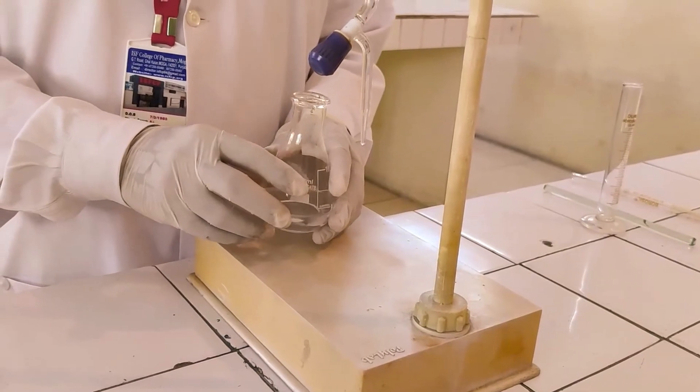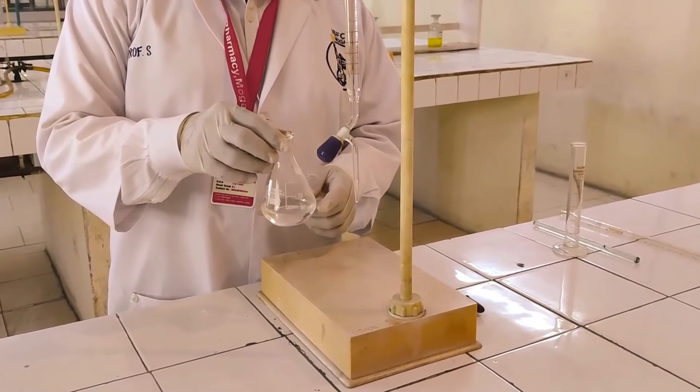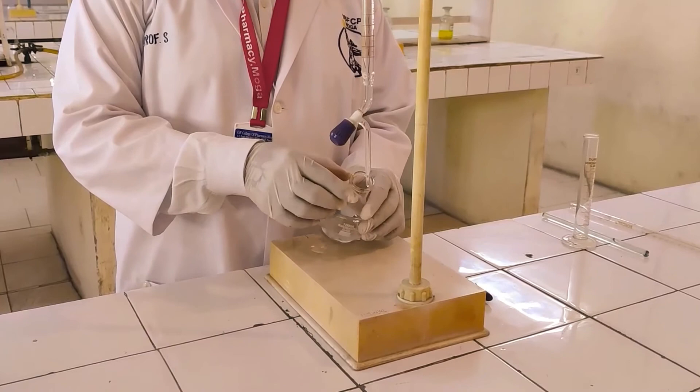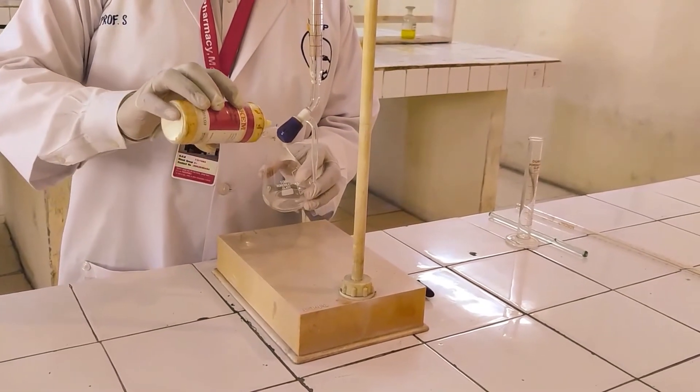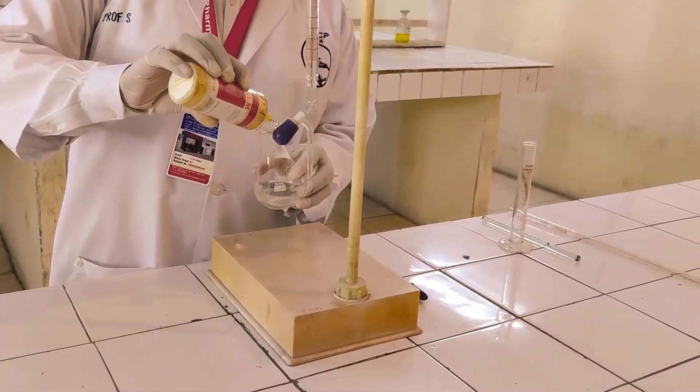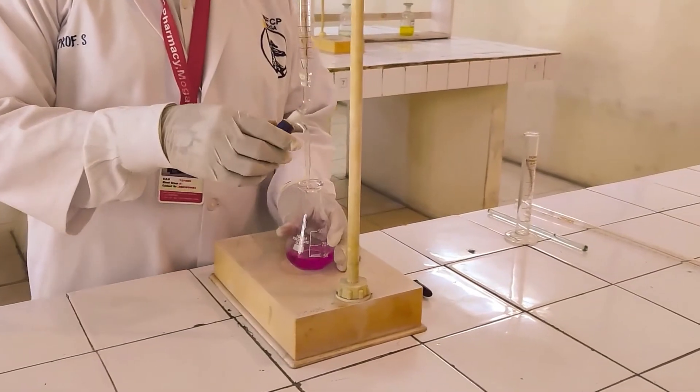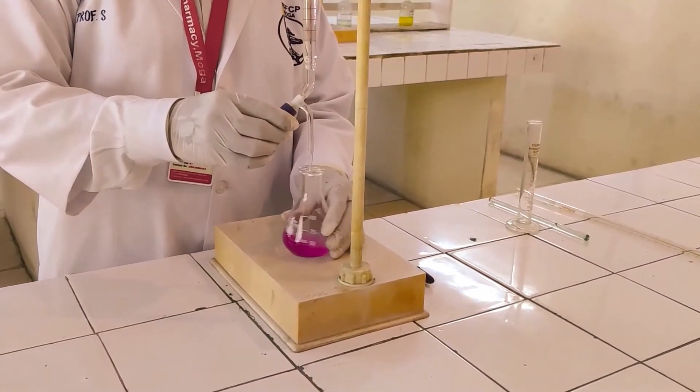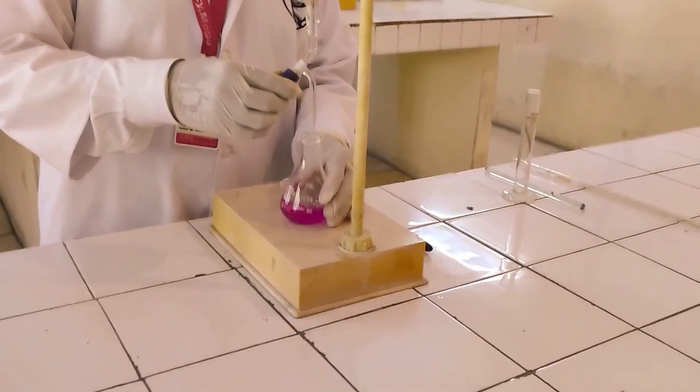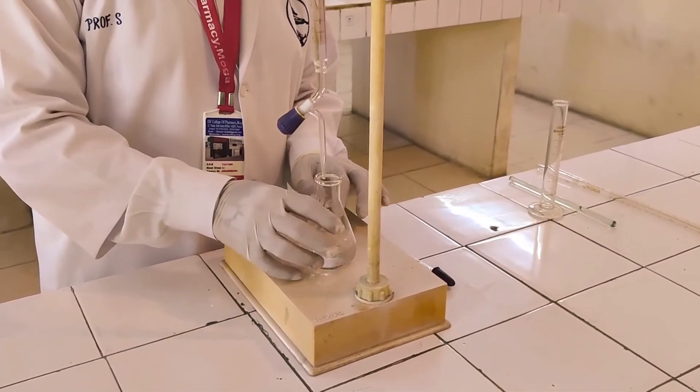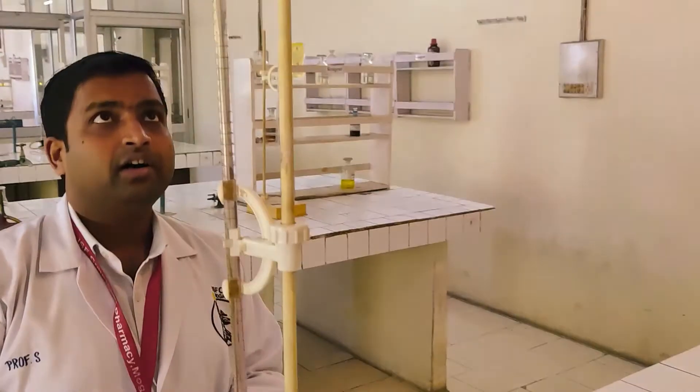In next step perform blank titration by taking a solution of 30 ml NaOH without drug and titrate it against 0.5 molar HCl solution using 2 drops of phenol red indicator. When color disappears stop the titration and read the reading of blank.